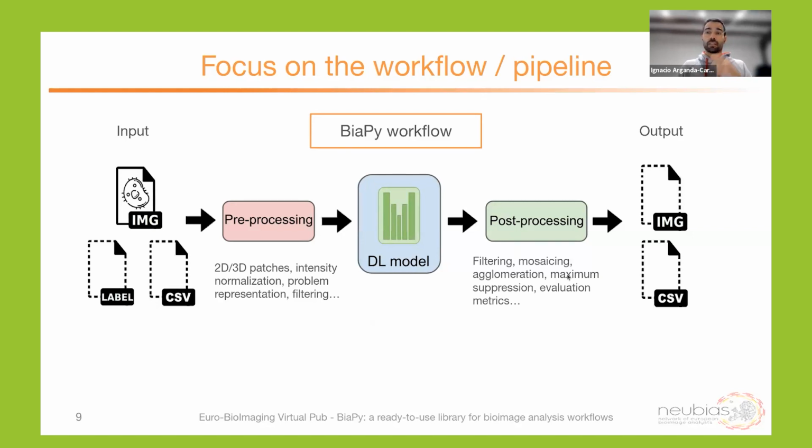And post-processing, as I said, there's a lot of things that we can do. Here, actually, the analysis is also performed in some cases. We have post-processing filtering, but also, very importantly, how do we do the mosaic of the different patches out of the input patches, or we have agglomeration methods, non-maximum suppression methods for detections or segmentations that are nearby, etc. And plenty of evaluation metrics, and we spent a lot of time on that too, of course, because we are focused on the computer science aspect of this, to really quantify our results.